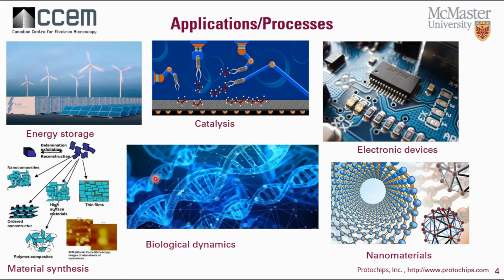In material synthesis, we can simultaneously study the structure, processing, properties, and performance in real time, like the oxidation reactions. In the biological dynamics field, we can understand the mechanisms that control biological processes like mineral formation. And in nanomaterials, we can directly observe the nucleation and growth reaction of nanoparticles.